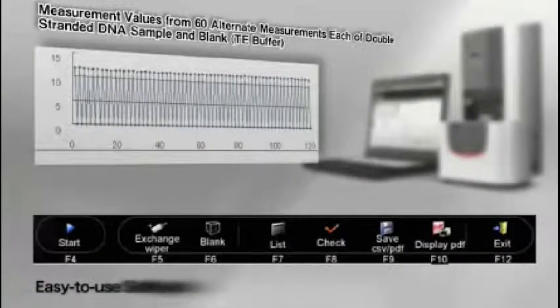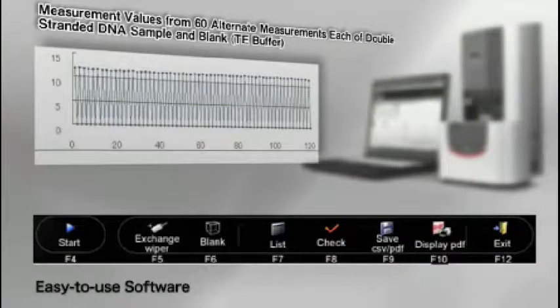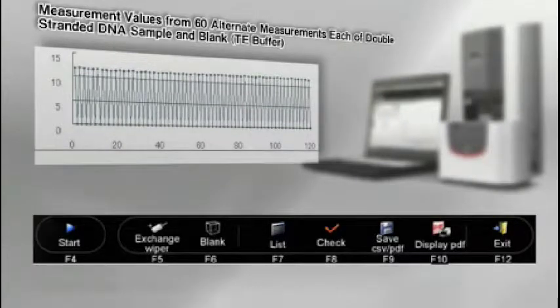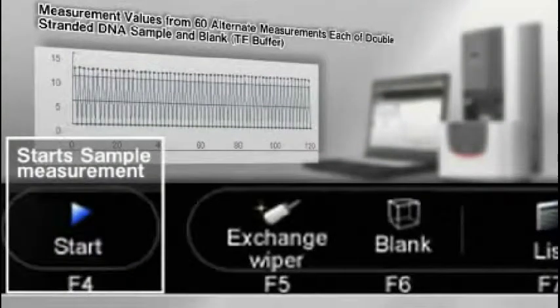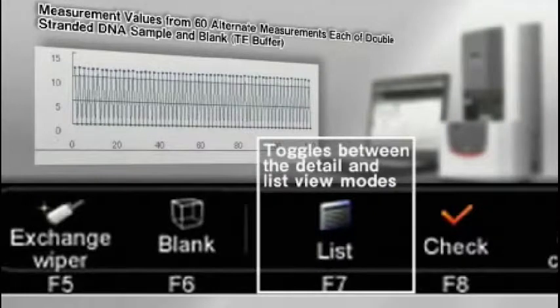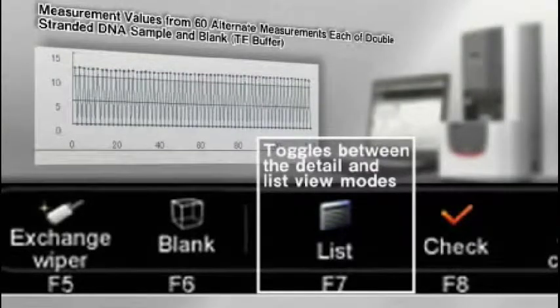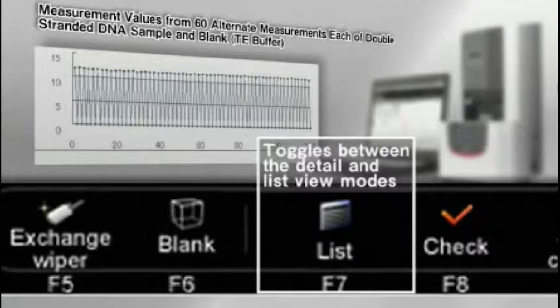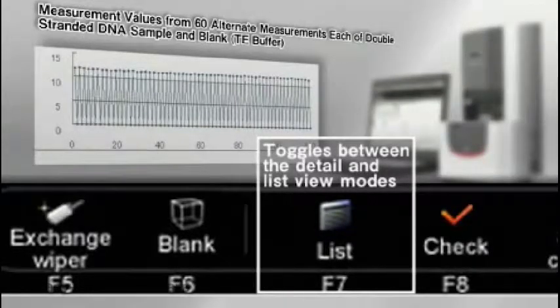Basic operations can be conveniently performed by clicking icons in the software or function keys on the instrument itself. Detail displays the analysis results and spectrum of the sample currently selected. List displays the analysis results of all samples in a table format.